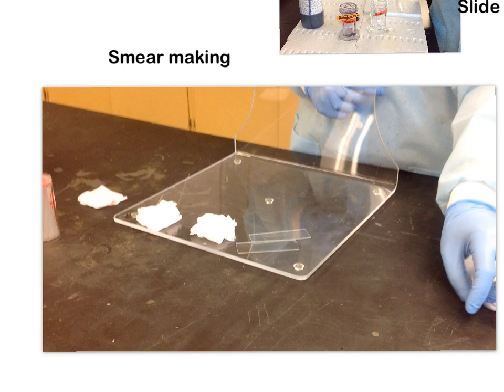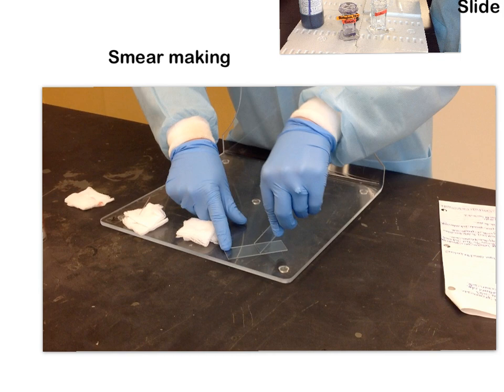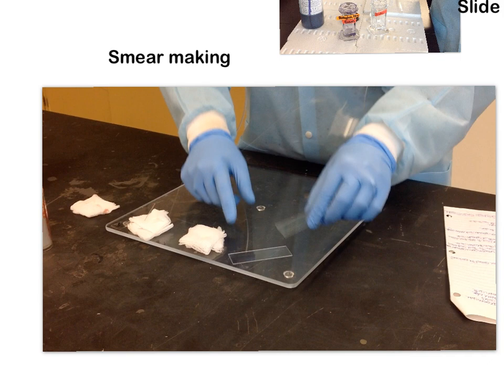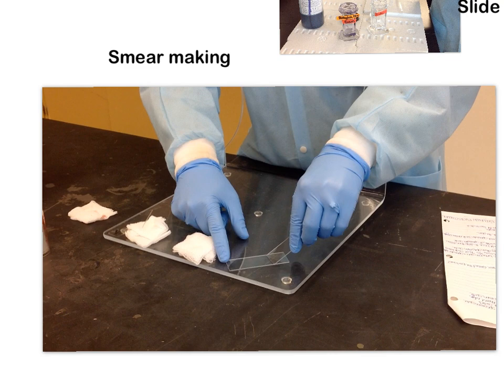The second variable is pressure — the pressure of our spreader slide on our specimen slide. Whether you're barely touching or really jamming it down, what we're looking for is an even and consistent pressure across the entire length of the specimen slide. You don't want jerky movement where you're suddenly light and then jamming it down. You want something nice, even, and fluid.